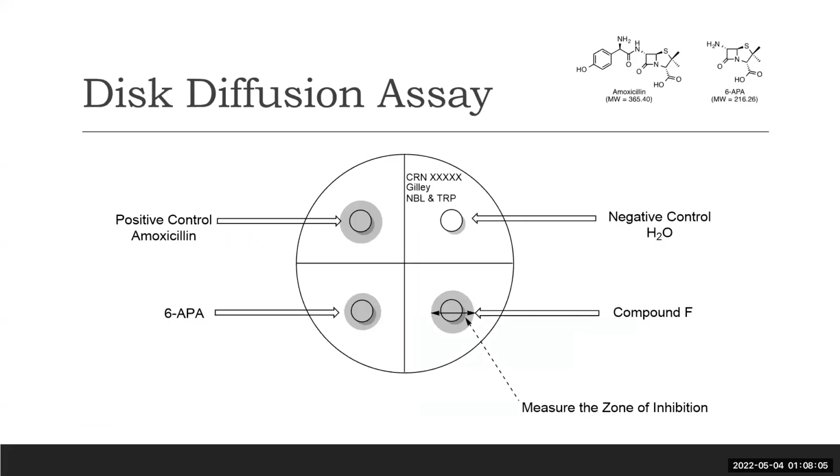Okay, so we're actually not going to be doing the biological testing ourselves. We're collaborating with a biotechnology class here at Miramar College. So this collaboration involves the organic chemistry lab, which is you guys making the compounds, and then they do the biological testing for us. And then both that class and our class can look at the plates after and can see the results of the biological testing.